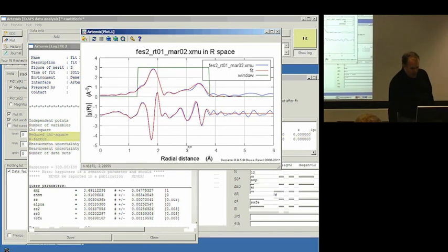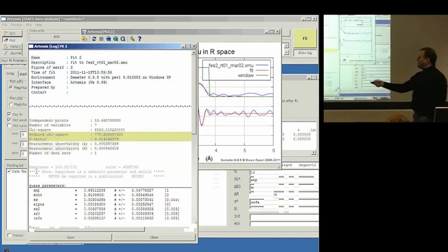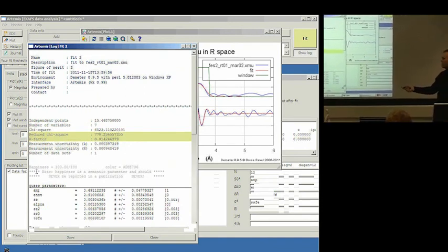If we look at the values of the parameters, things by and large actually make pretty good sense. The S0 squared parameter got a hair better than it was last time. If you recall, the last time it was, I think, 0.66, and now it's 0.69. It's still a little smaller than I would expect, but, looky there. E naught is a reasonable value and with a reasonably sized error bar. Alpha is a positive number but consistent with 0. And let's go look and see how that propagated through the whole problem.